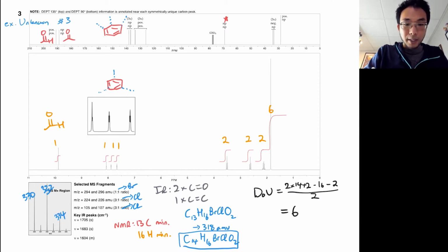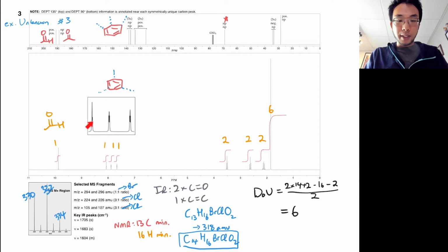So that means that all of these hydrogens are going to have 4J couplings. And in fact, if these three groups are different, then I should have 4J couplings that are different from each side. So I should have a doublet of doublets, or perhaps just a triplet if those J values are identical. If I go through, you can see that showing up in the zoomed version. So you can see that triplet, triplet, triplet type of pattern. So this substitution around the benzene ring makes sense.